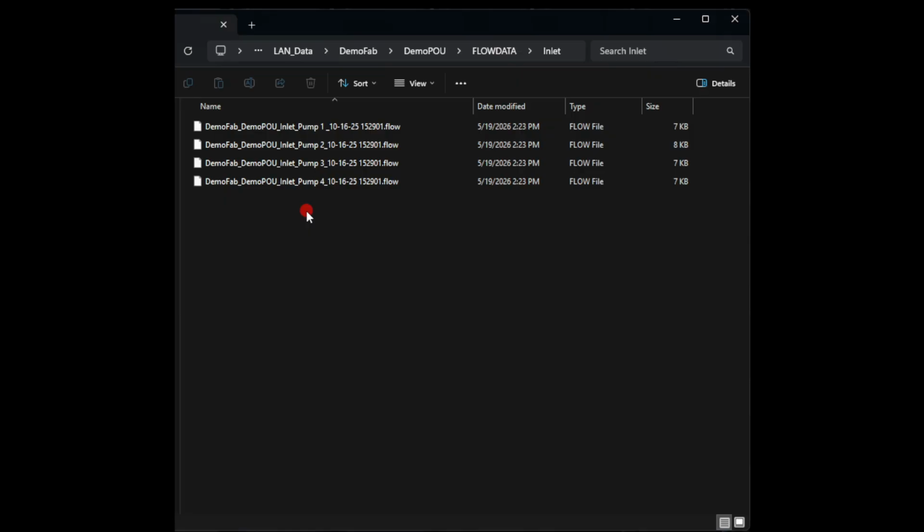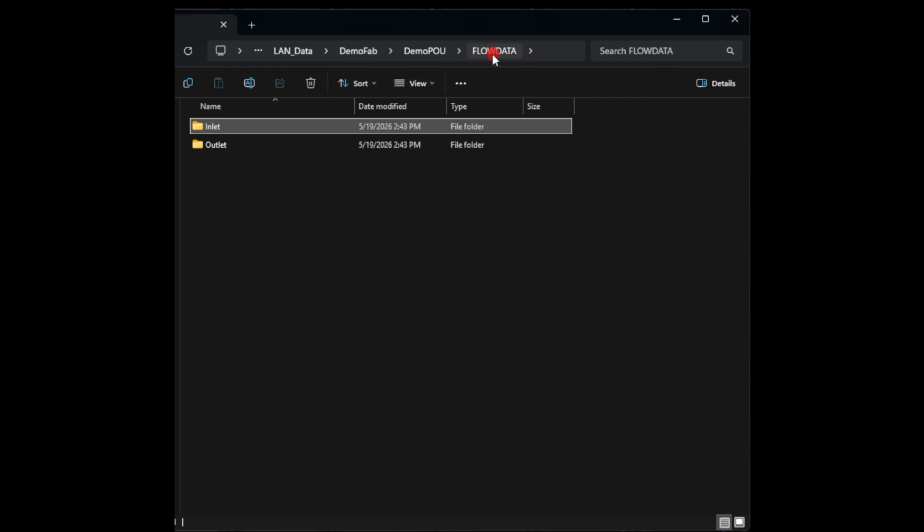And after I explain this file location, I will go back through and show you what all of these files look like. But for flow data, which is the concentration results of your flow test, we have inlet and outlet measurements. And then this is our DRE folder.